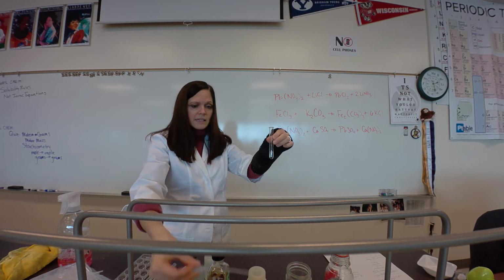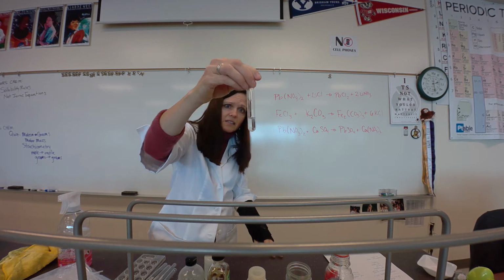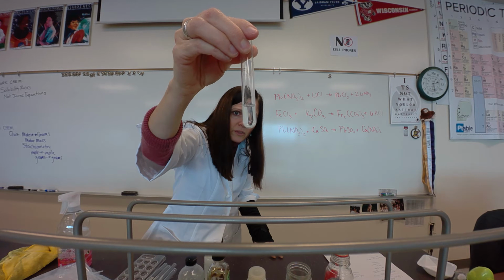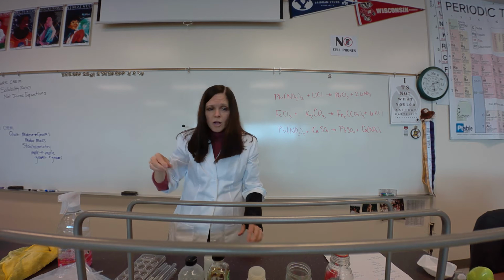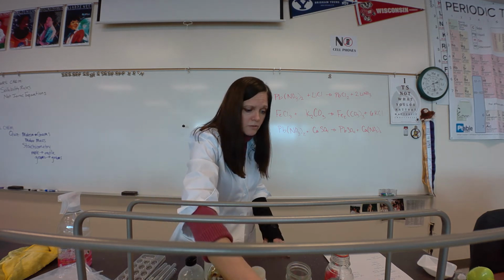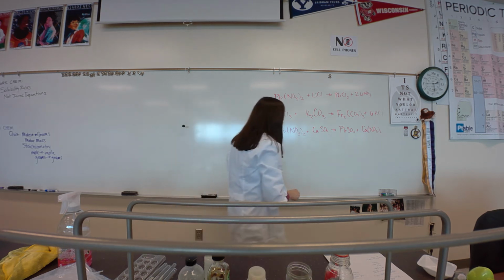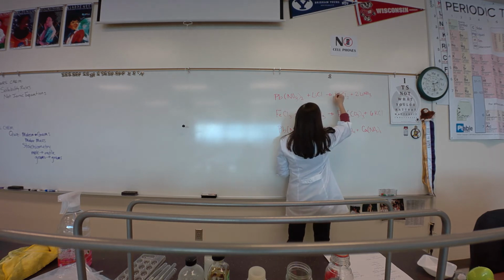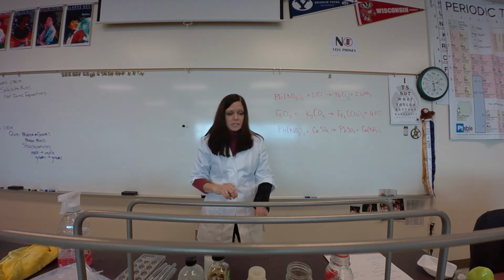Now, that's not such a great reaction, but if you can see, there is a bunch of cloudiness in there. It's not all soluble. There's little white crystals in there. It's not super colorful, but we do get some cloudiness. That cloudiness that we see in there, we would expect that to be the lead II chloride, okay?